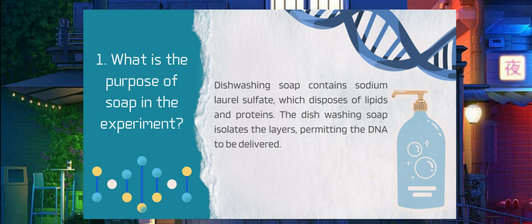Water is a highly polar chemical. The shared electrons that form the covalent connection between the hydrogen and oxygen atoms are not distributed evenly. This leads the electrons to cluster closer to the oxygen atom, giving the hydrogen atoms a partial positive charge and the oxygen atom a partial negative charge. The partially positive charge of the hydrogen atoms in a water molecule attracts the negatively charged sugar-phosphate backbone of the DNA.